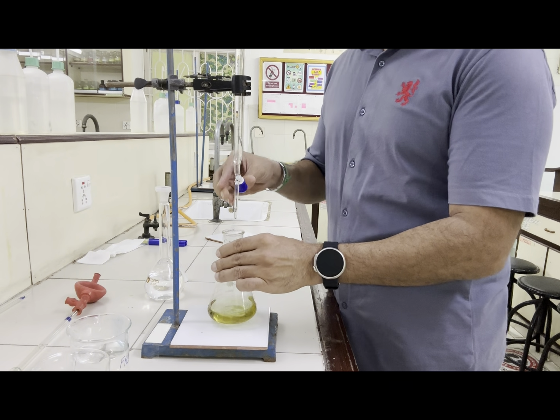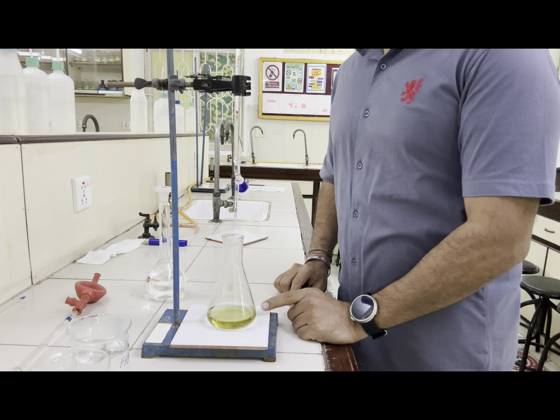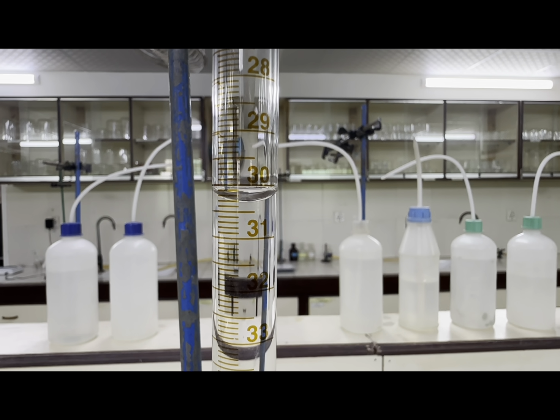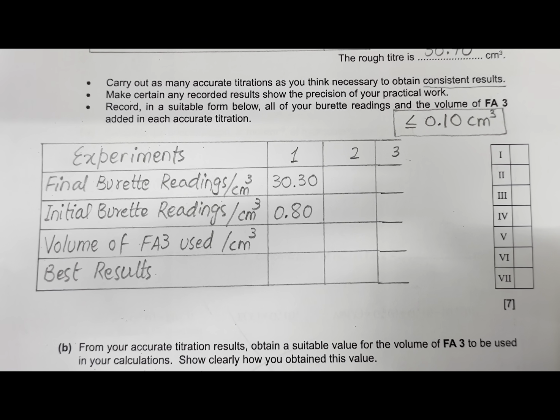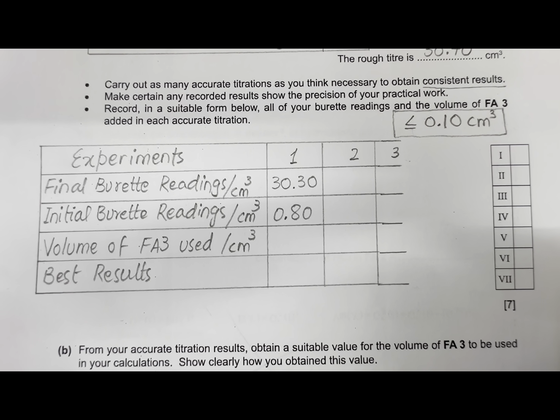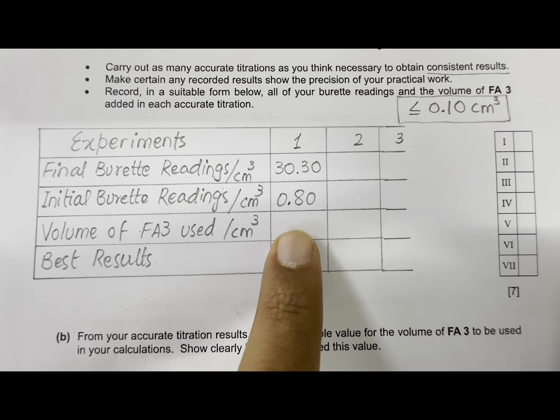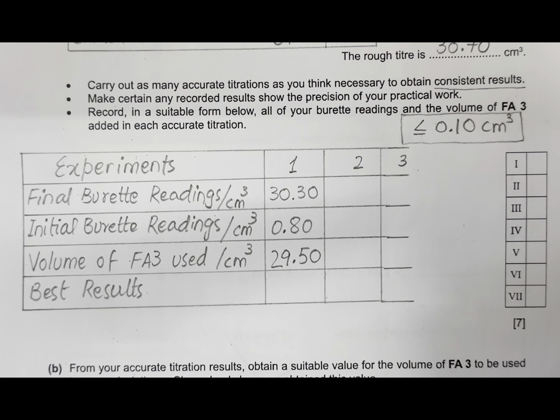So I have stopped as soon as the solution turned yellow. So this is my accurate titration performed. This is the final Burette reading, 30.30. So I have recorded here the initial and final Burette readings for the first experiment. I will subtract these two values to get the volume of Fa3 used. So this is my volume used.